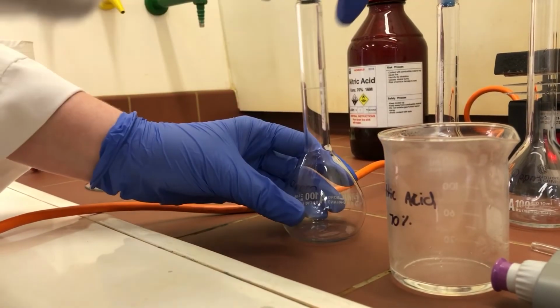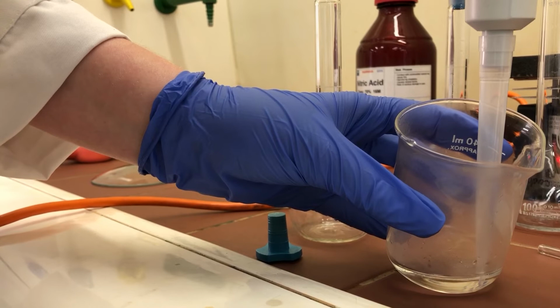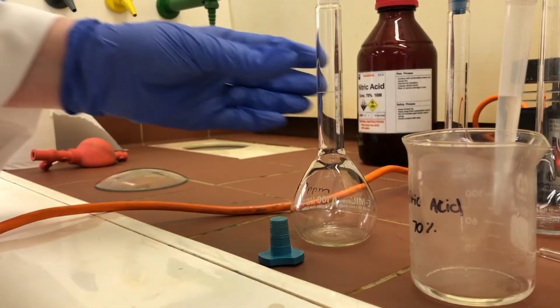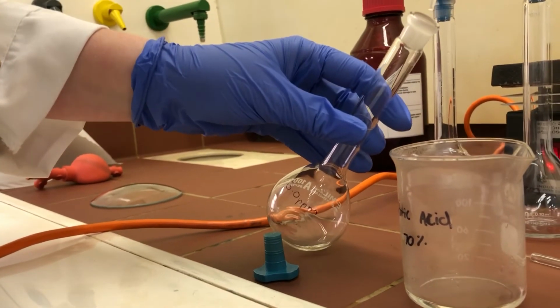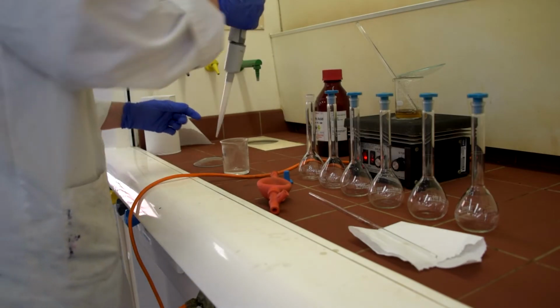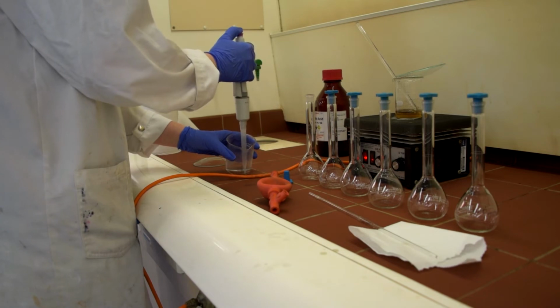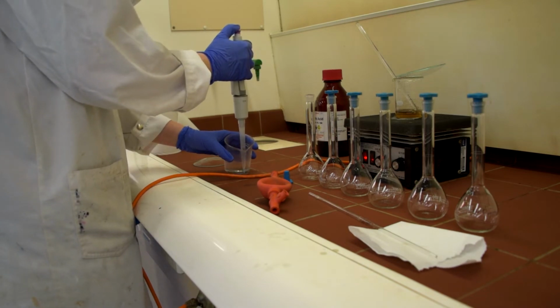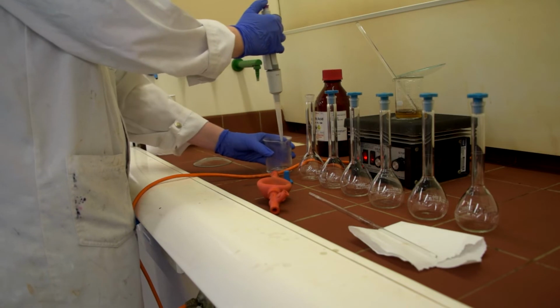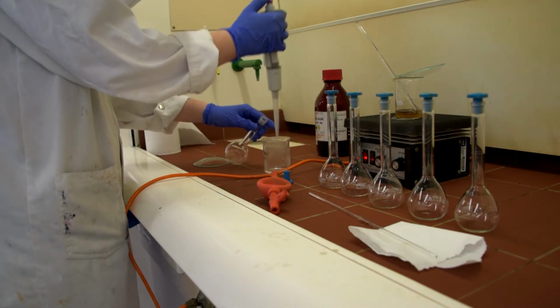To each standard solution, 2 ml of concentrated nitric acid is added using an autopipette. As you may remember from earlier in the video, 2 ml of acid was also used in the sample. Using the same volume of acid in the sample and the standards ensures that the matrices of these are identical. This is called matrix matching and reduces the interferences caused by the acid. Once the acid is added, these solutions were made up to the mark using deionized water.